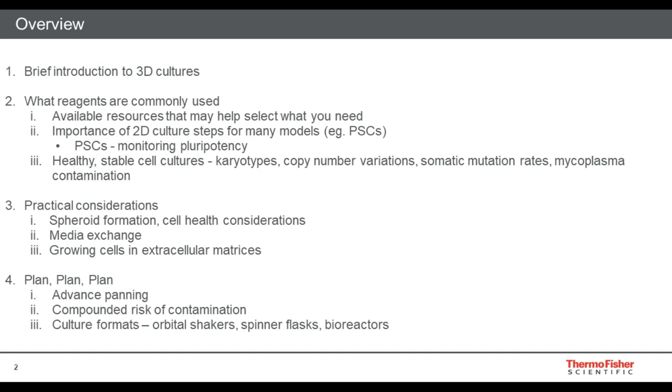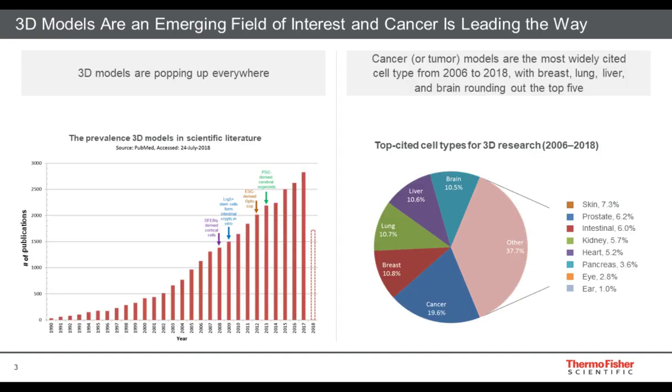So with that, I would like to start by briefly introducing people to the wonderful world of 3D cell models. As many of you are aware, this is an emerging field that is really drawing a lot of interest across a wide range of research areas. It's been climbing into prominence over the past decade or so, with the publication of several key or seminal findings, only a couple of which are highlighted here in the graph on the left.